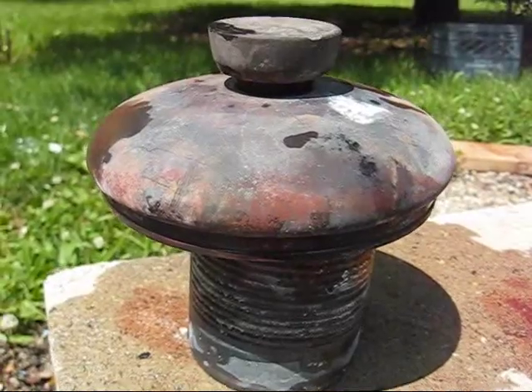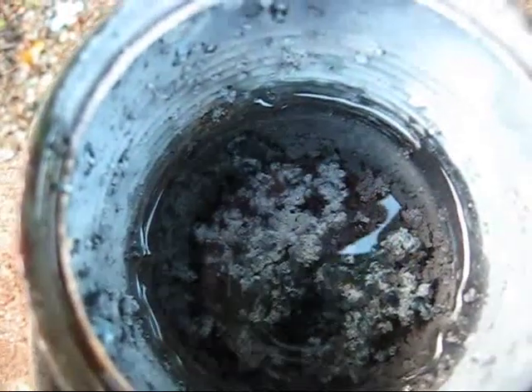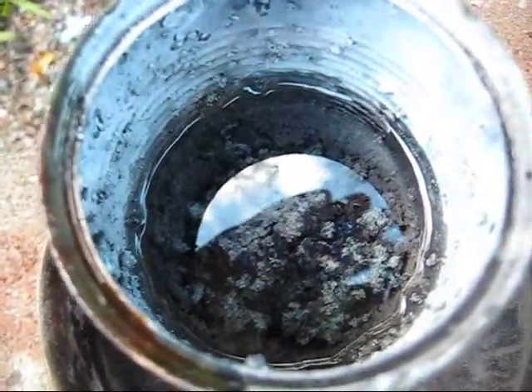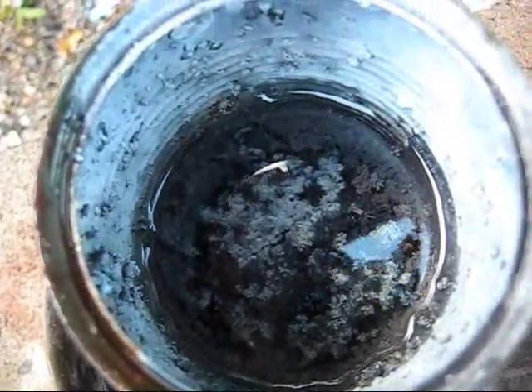Then I'll be able to open the lid and pour in mineral oil. Here you can see I have poured mineral oil over the newly formed sodium, and it has halted the reaction totally.